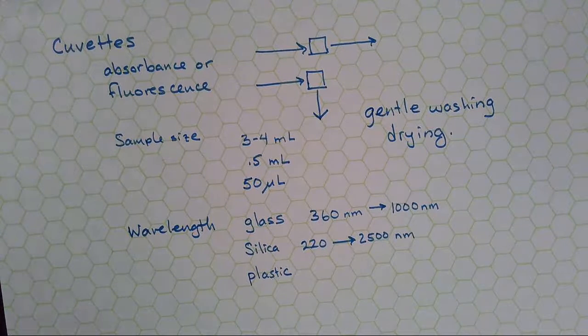The glass ones, though, like that small volume cuvette I just showed you, are around $400. So I felt bad when I broke it. I'd been using that one for 12 years. It had a good long life, but it just did not survive the summer.